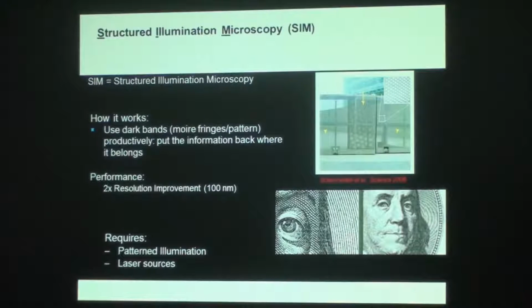That's fundamentally the same principle used in the structured illumination microscopy. Because this is high frequency information which is not transferred to your eyes, because we have a very low bandwidth. But when you superimpose structured illumination on top of each other, then you reveal the structure. And this is used in everyday life.